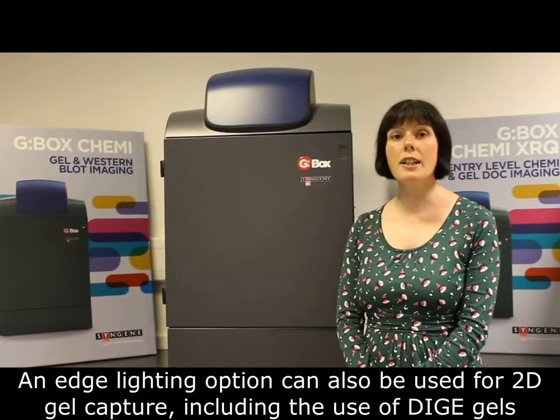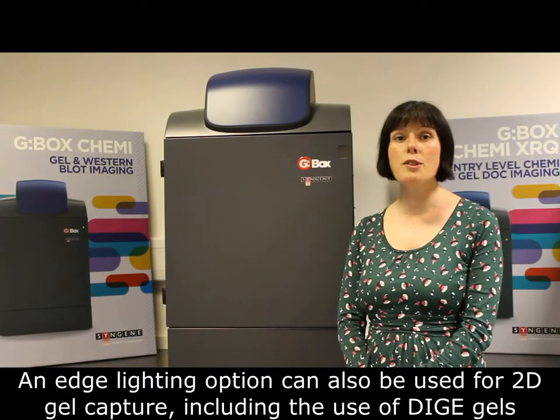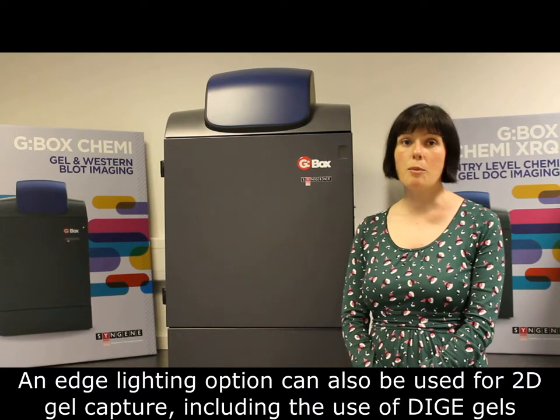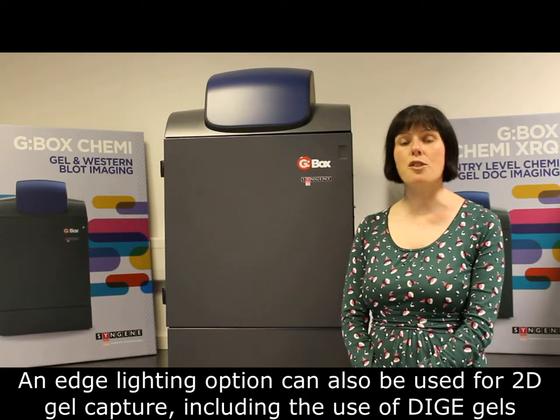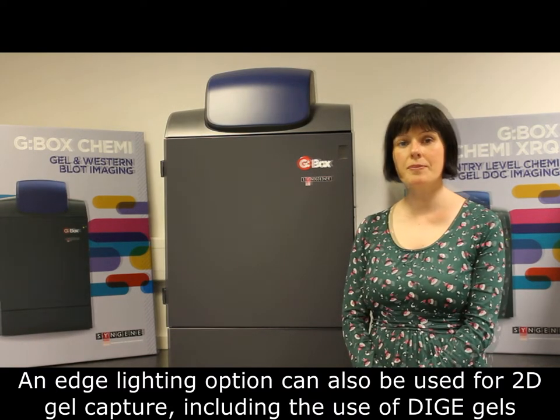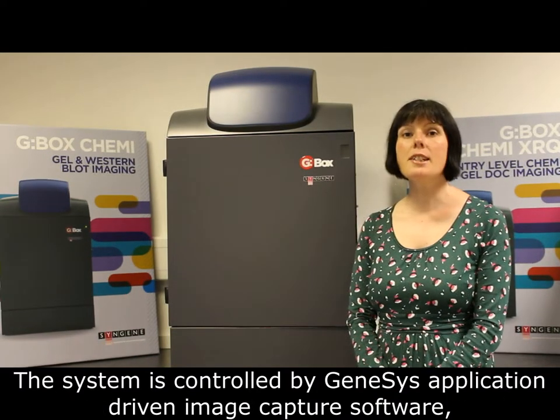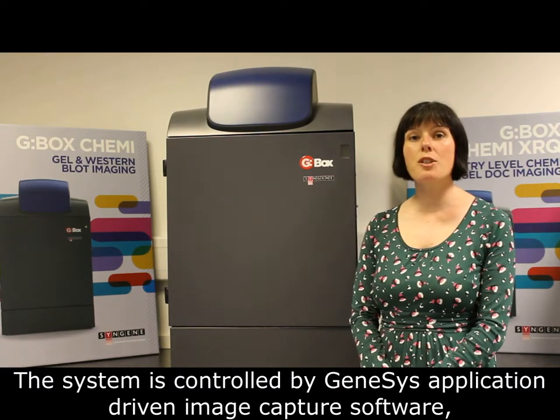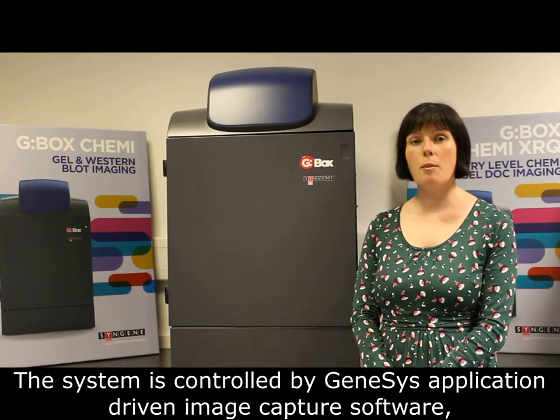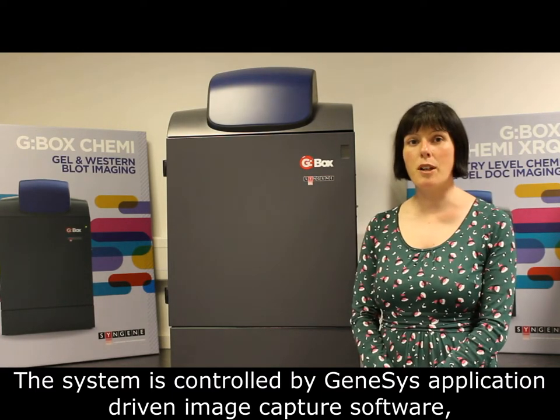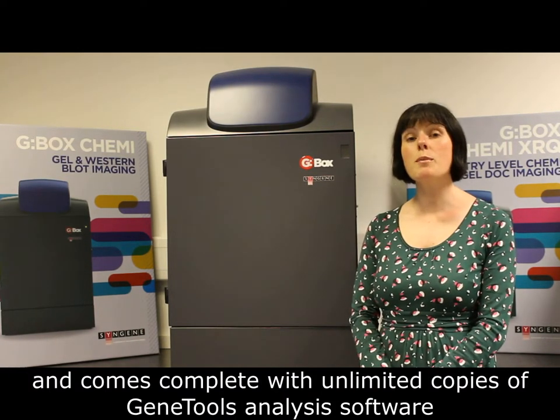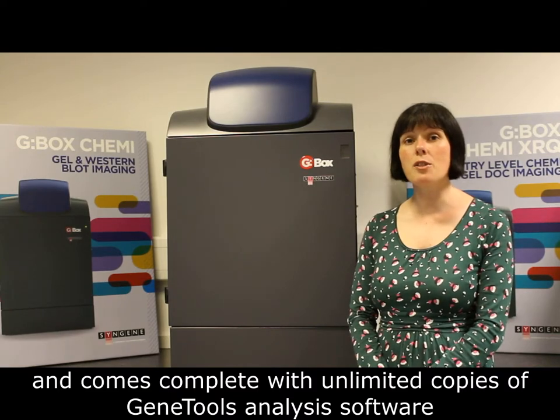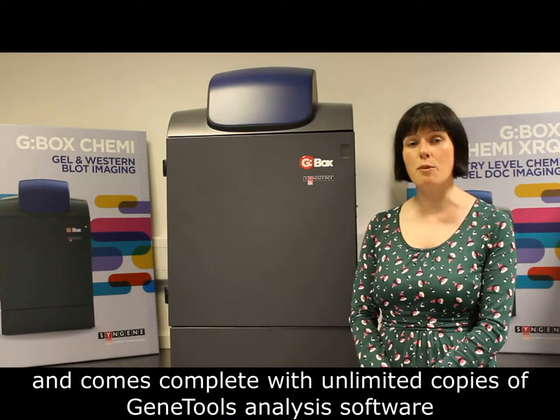An edge lighting option can also be used for 2D gel capture including the use of DIGE gels. The system is controlled by GeneSys application driven image capture software and comes complete with unlimited copies of GeneTools analysis software.